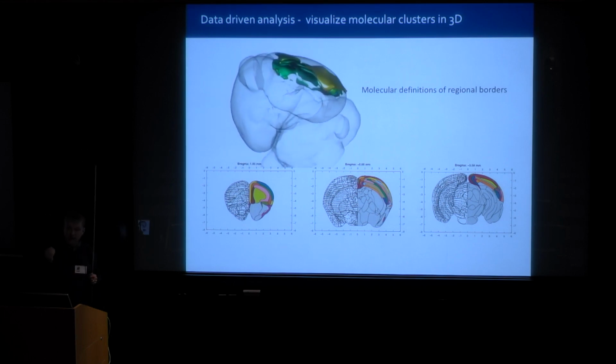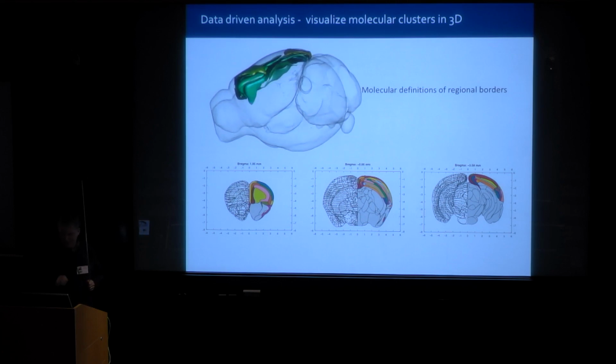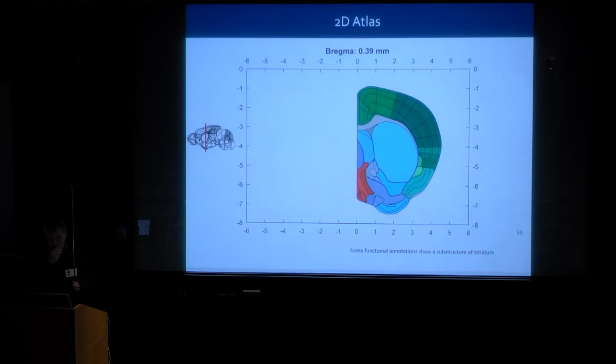So this is a very, very long movie since we are building up the entire brain, so I will not show all of it, but you get the feeling of how they superimposed over each other. So if we look for this one, which is this part of the brain, this is the Allen brain. You have structures here, but in this part, which is the striatum, you don't really have any morphology. You have no structure.